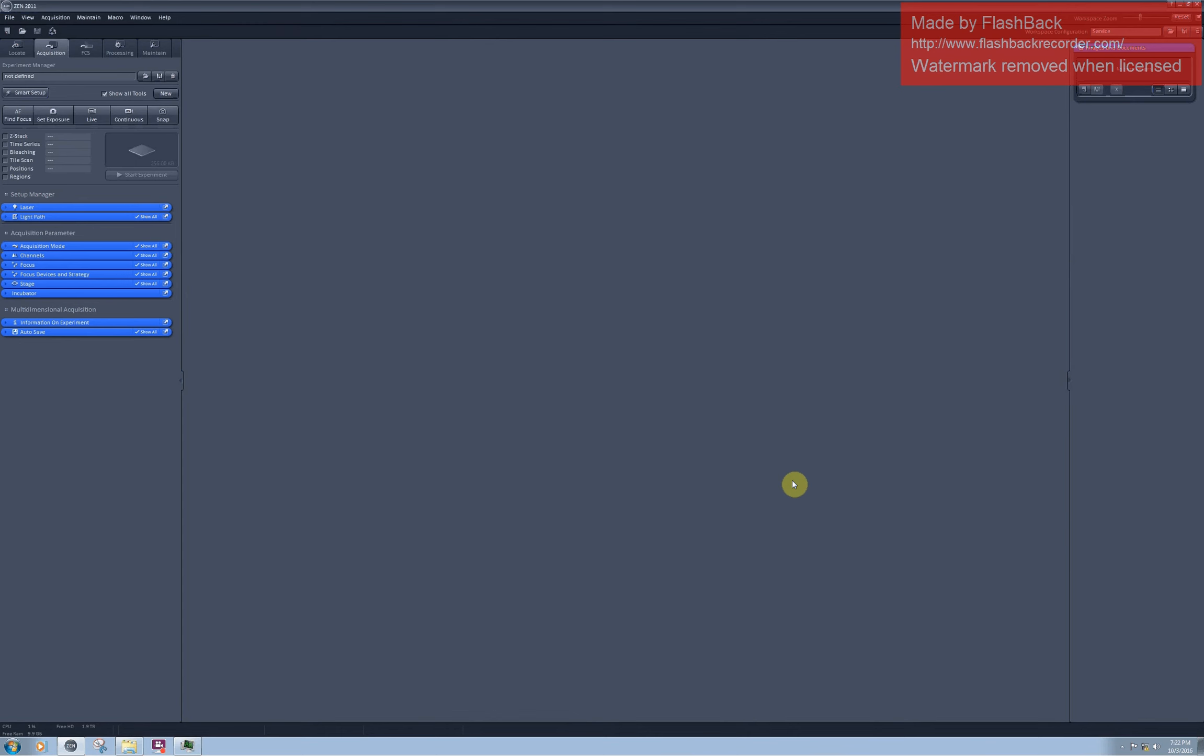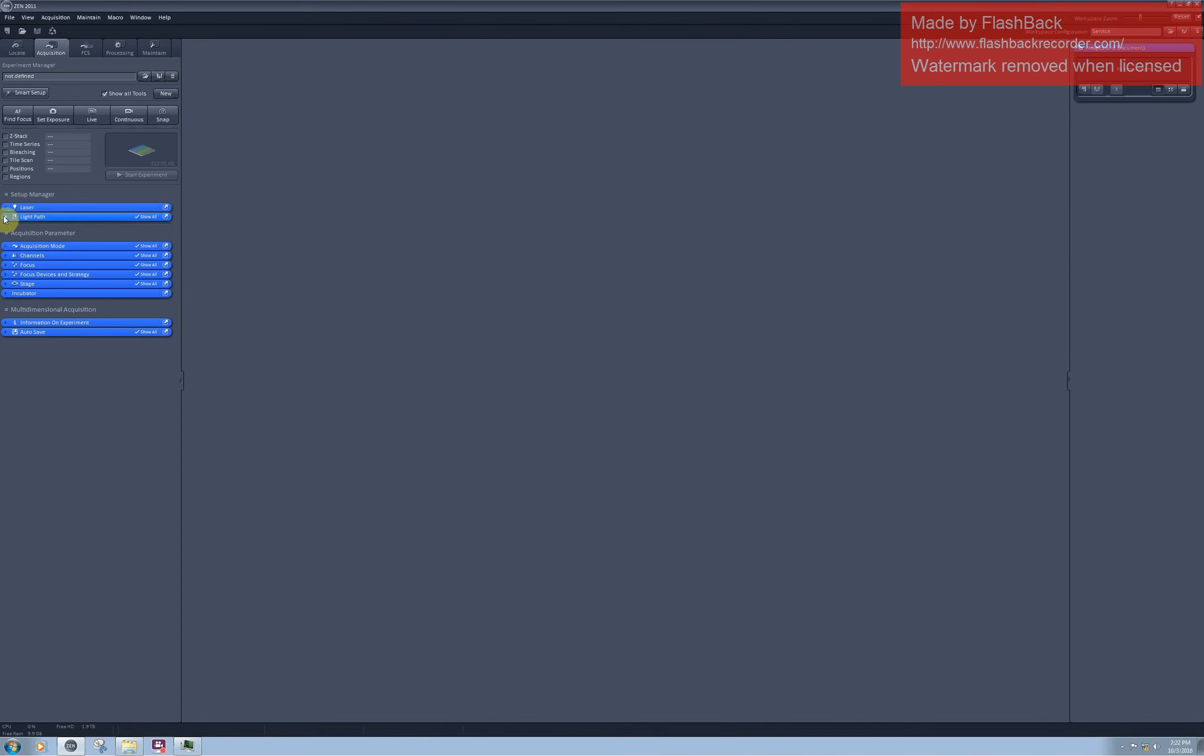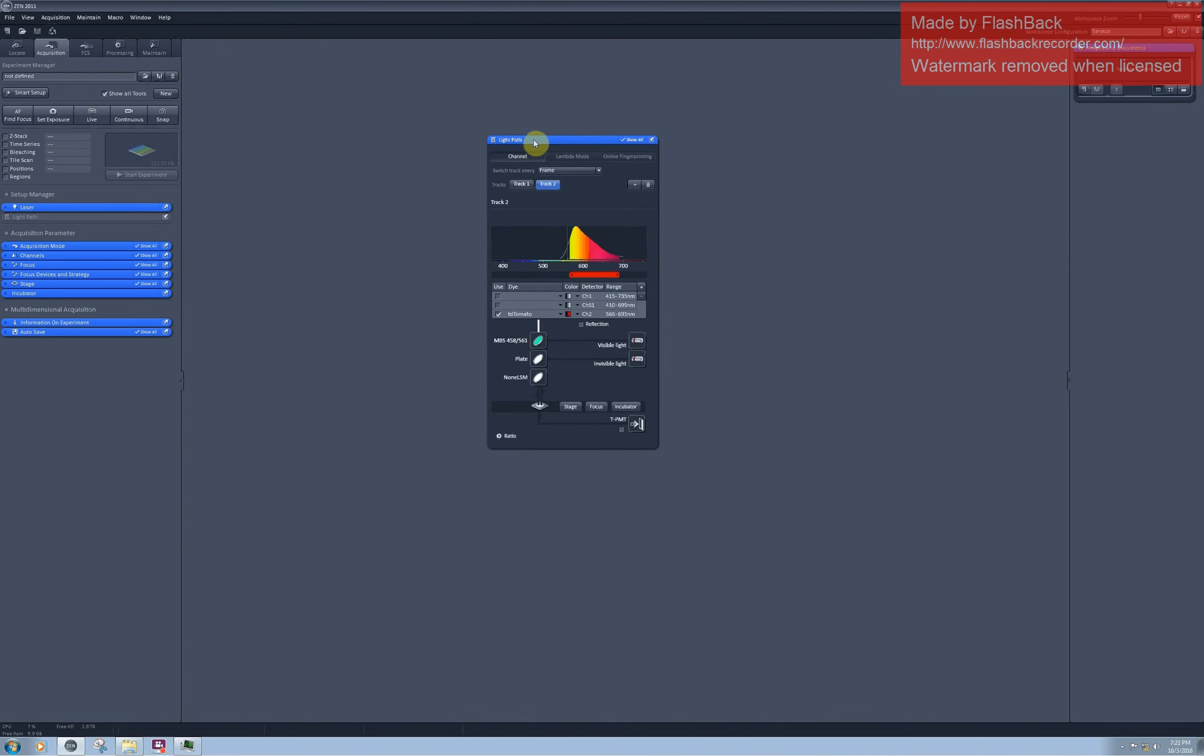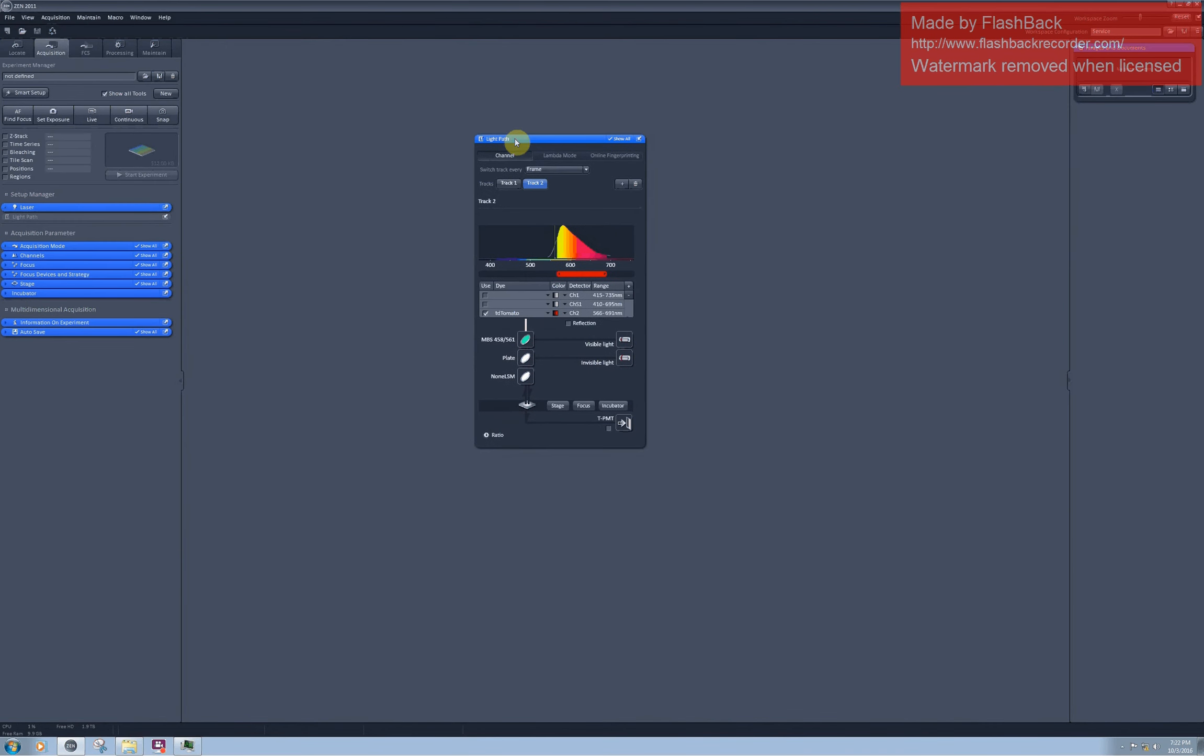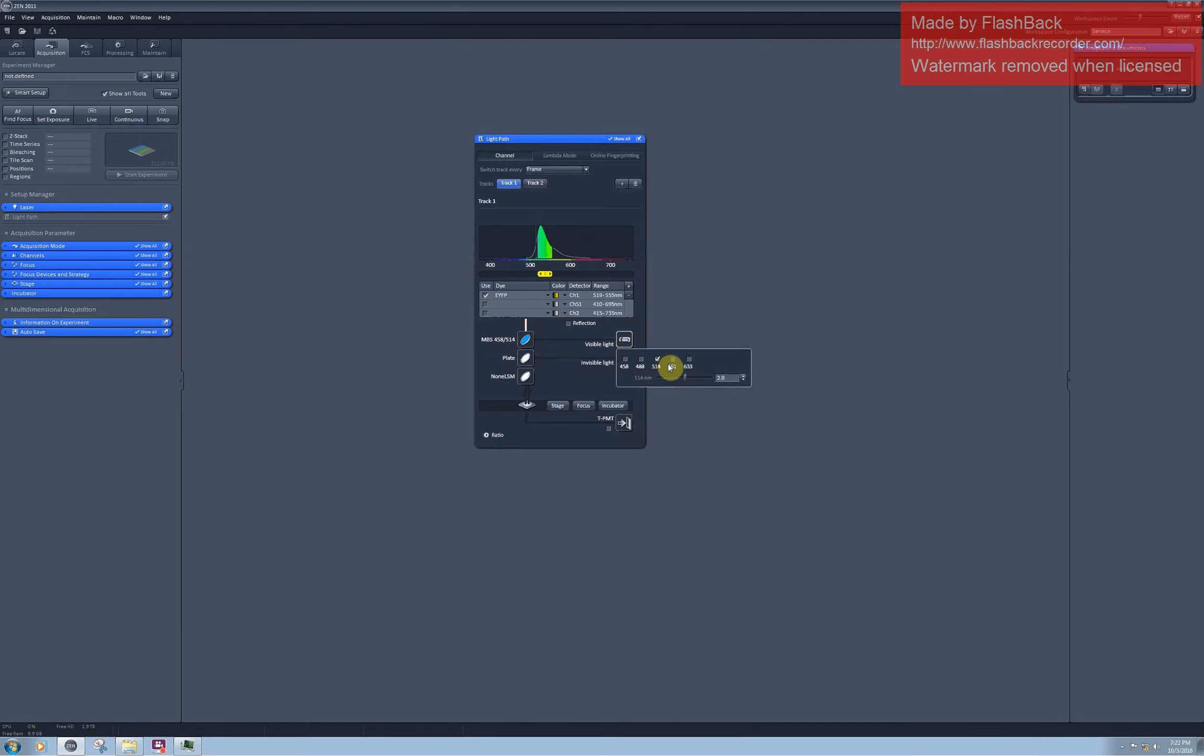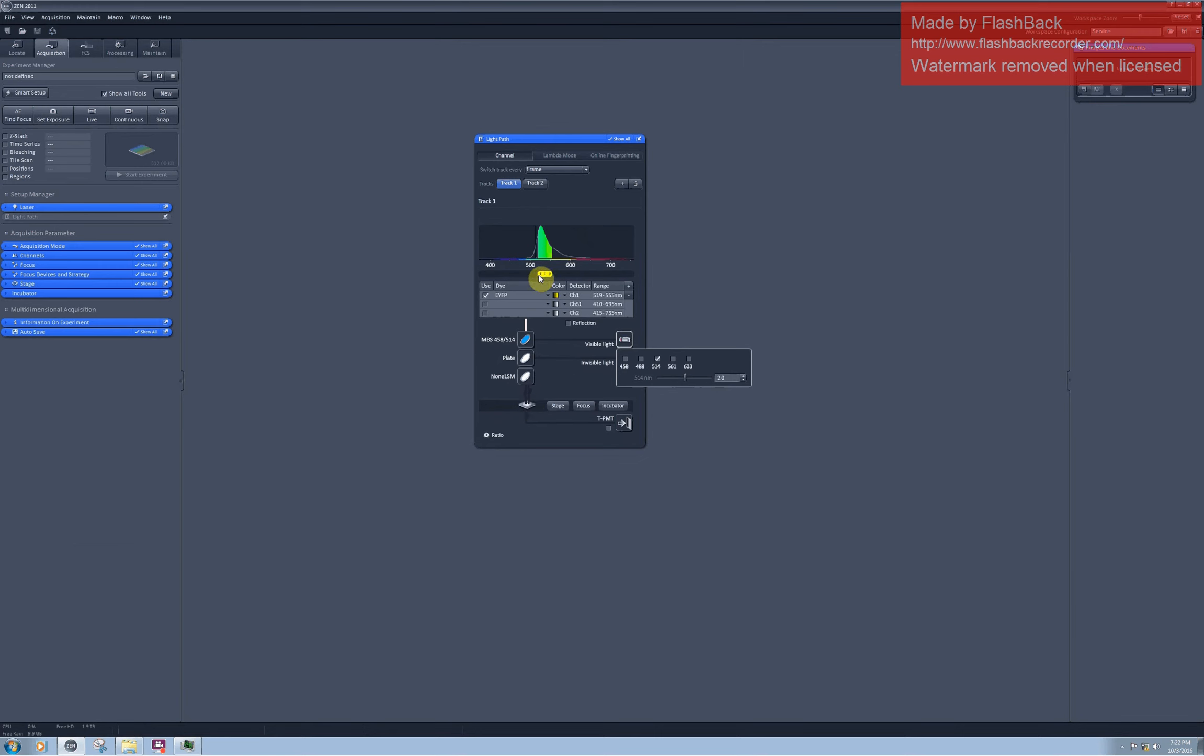You will hear the hardware in the scanning head moving. You can see what the smart setup set up for you in the light path. As you can see, I have two tracks now. In track 1, the software kindly switched on the 514 nm laser for me and set its intensity to 2%, and then put in the light path the main beam splitter which can reflect 514 nm light towards my sample. Then I will be detecting this part of the spectrum on detector 1.